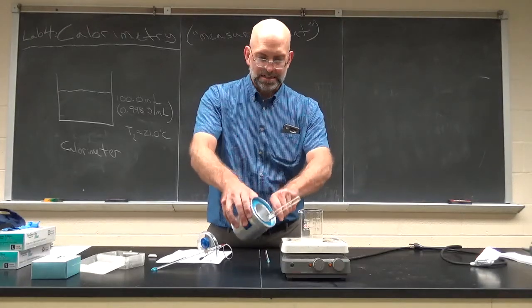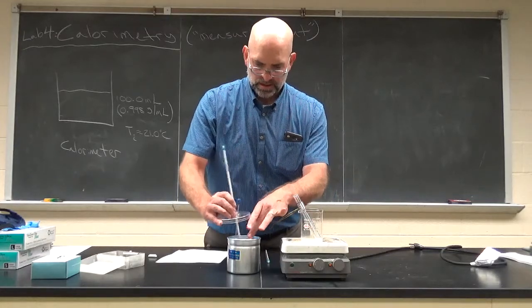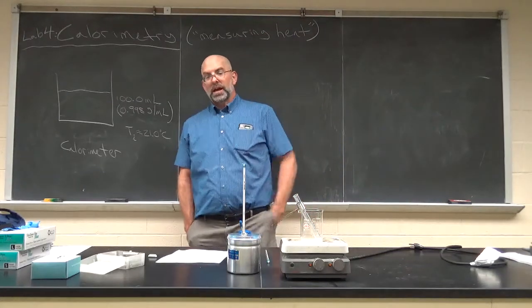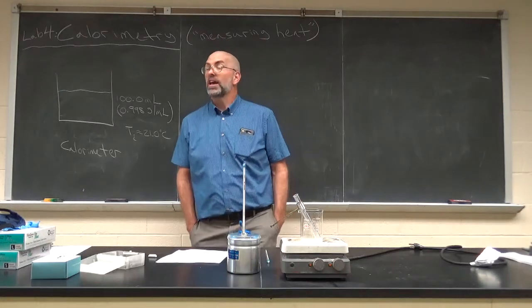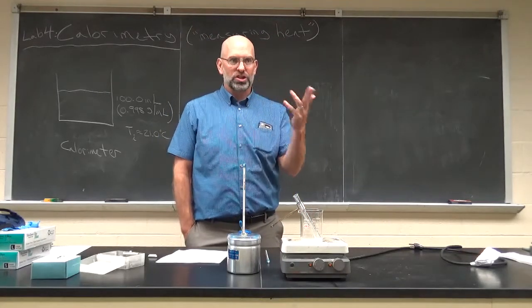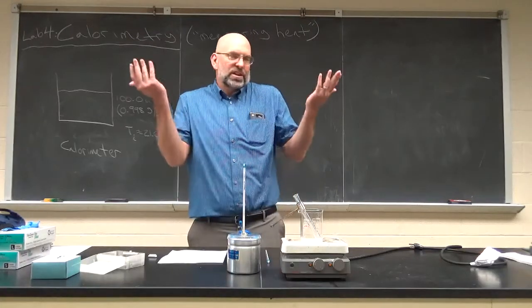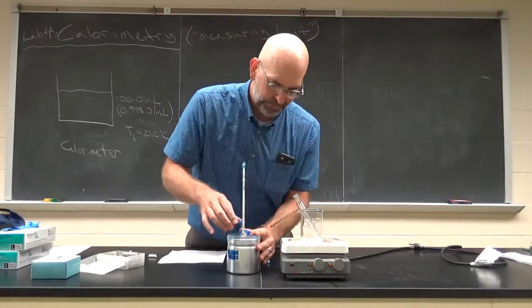So then what you do is slide that in and, more quickly than I'm doing, put the lid back on. And you want to see how high the temperature goes on this thermometer. It will not go up very much. It may only go up a degree or two with 100 milliliters. And again, we may adjust these volumes, because if we use 50 milliliters of water, the temperature is going to go up more than with 100. Maybe that's intuitively obvious. So we will see.